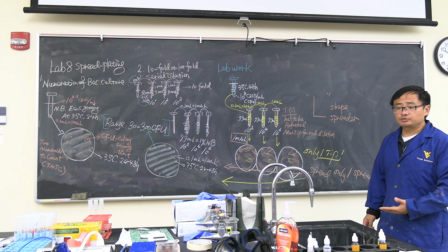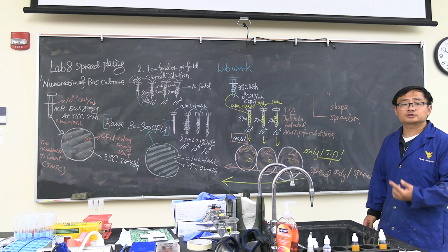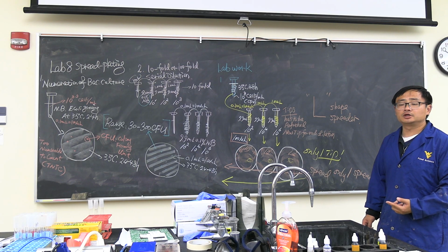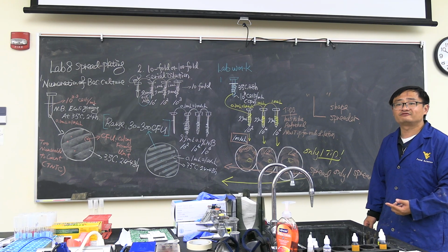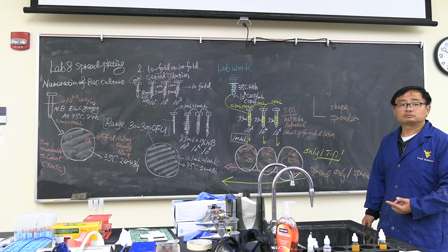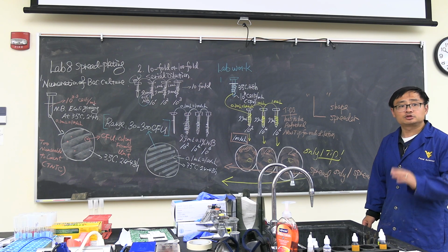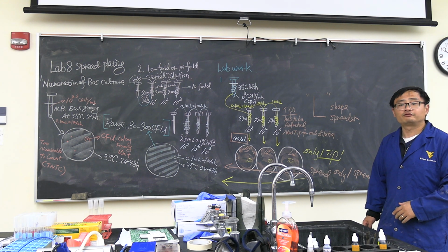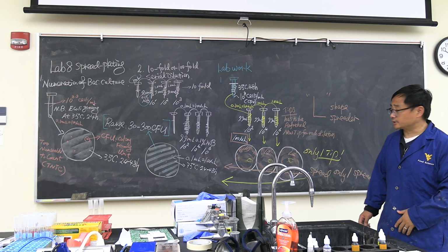I think today we're gonna have about a week, so put these on your personal rack. Ideally, we can incubate at 35 degrees for 48 hours, but next week will be very messy. So, with this temperature around 25 degrees Celsius with E. coli, you just put on your personal rack. We wait for 4 days. We'll count next Tuesday. Okay, that will be the plan.